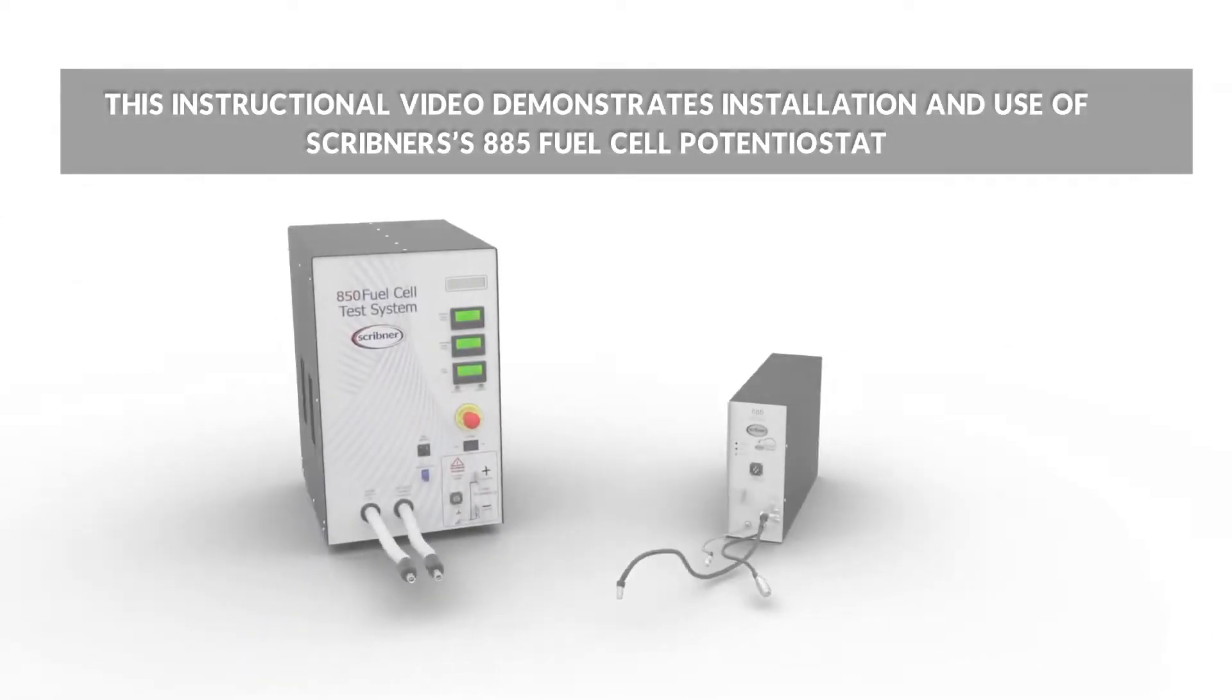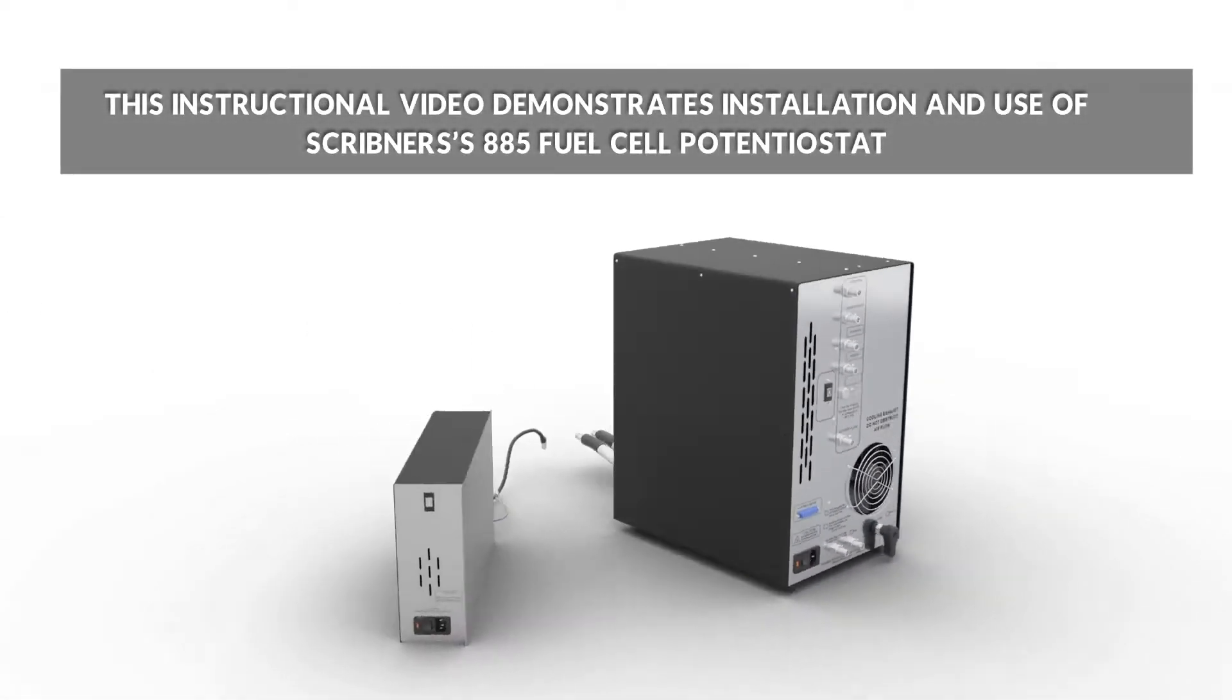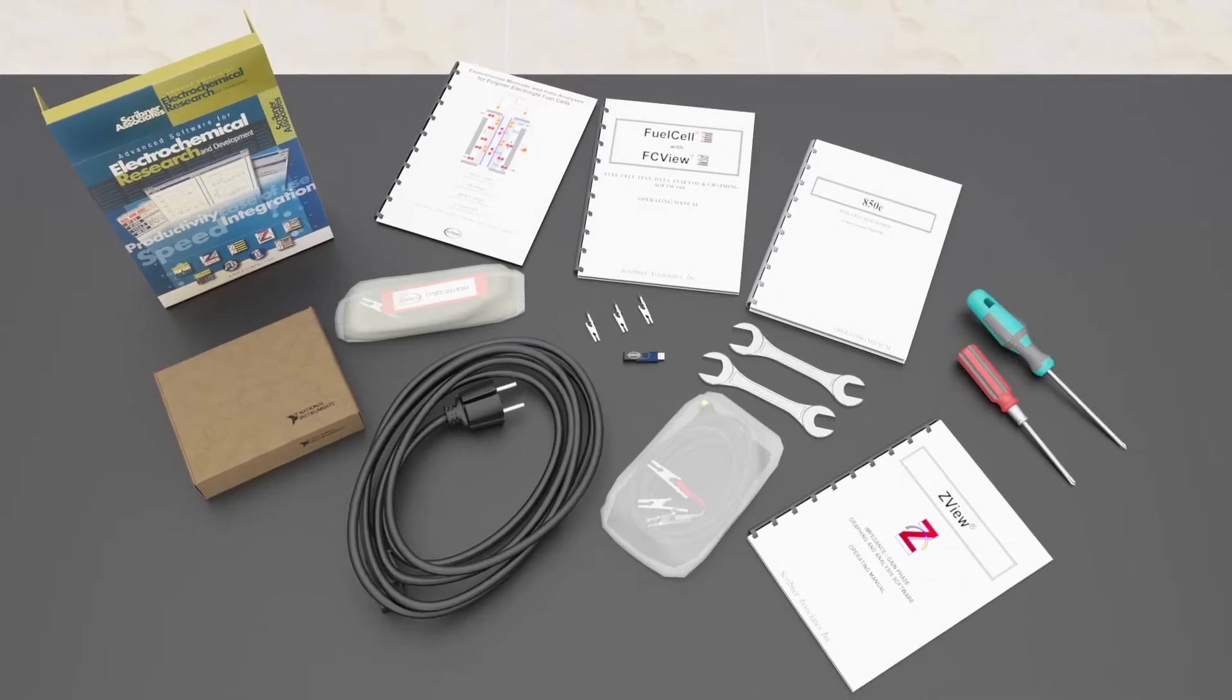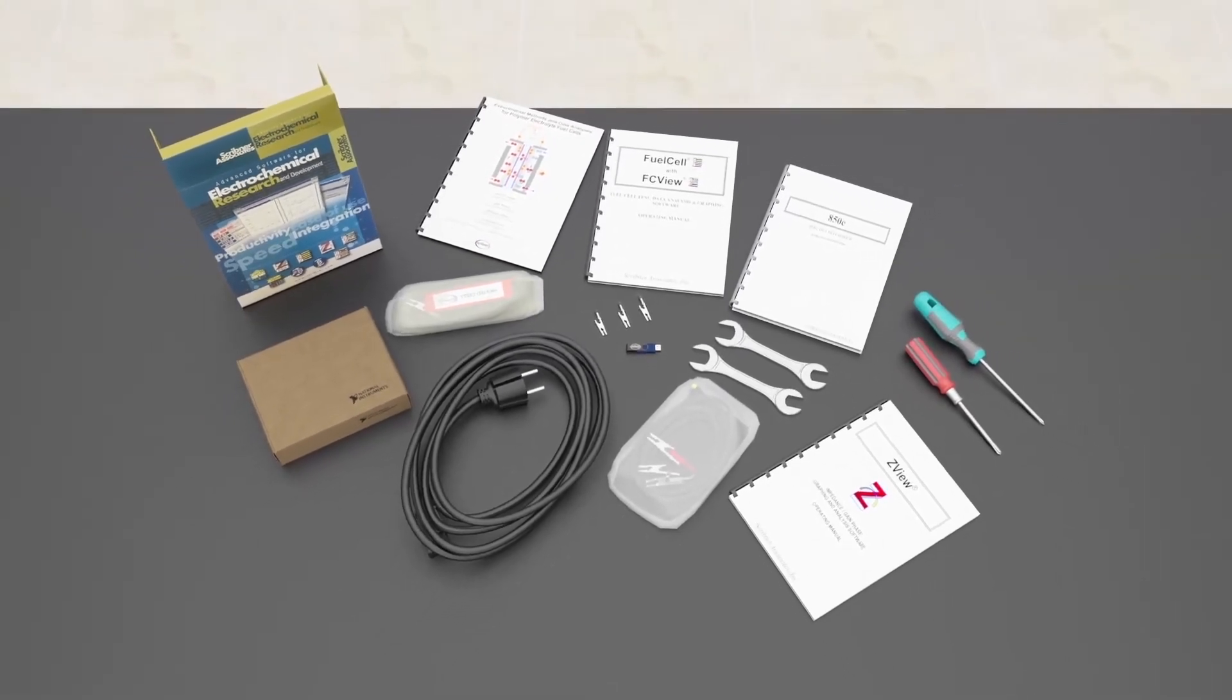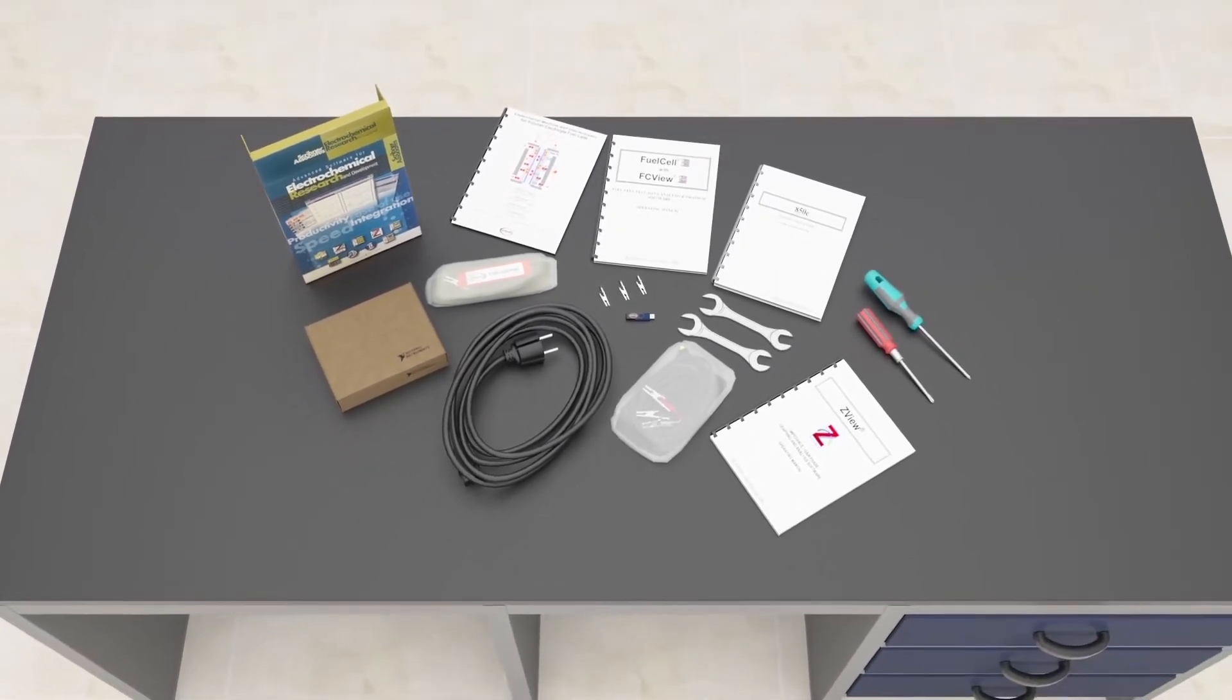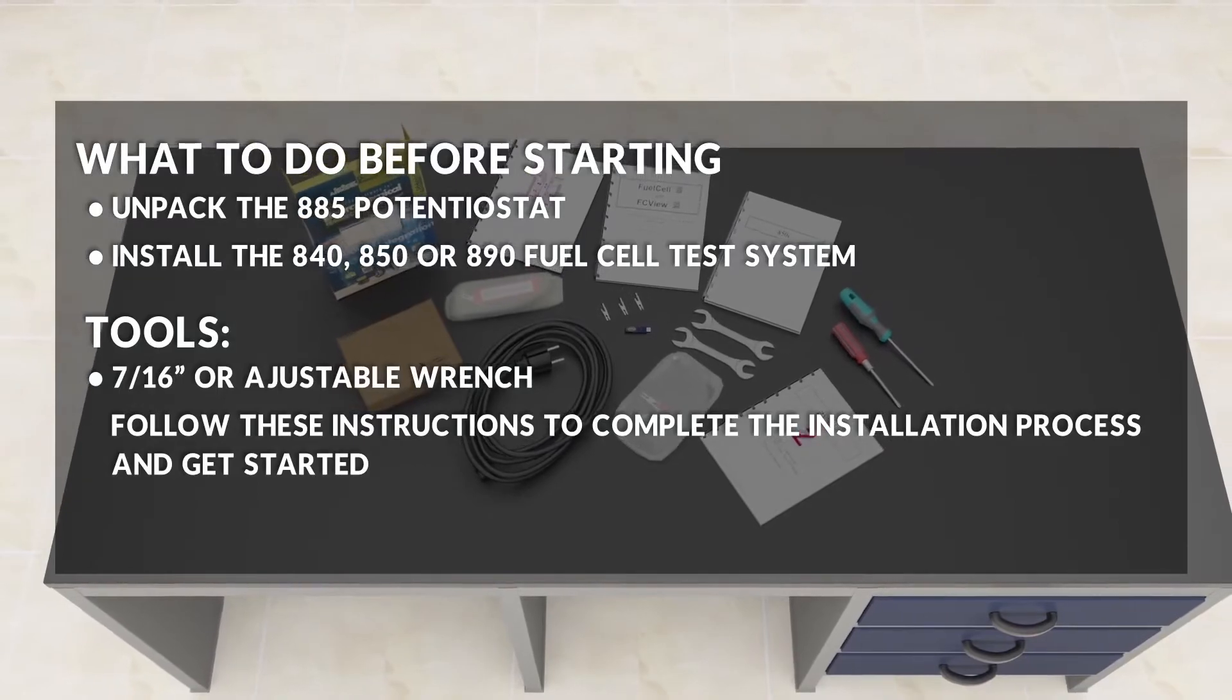This video demonstrates installation of the 885 fuel cell potentiostat for an 850 fuel cell test system. The steps are similar when installing the potentiostat for an 840, 855, or 890 test system. Follow these instructions to complete the installation process and get started.